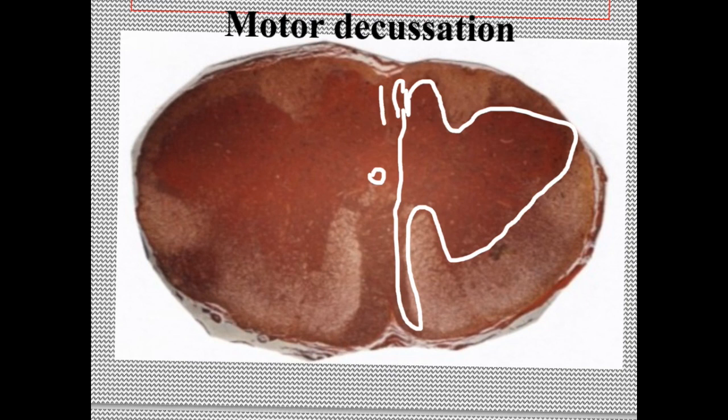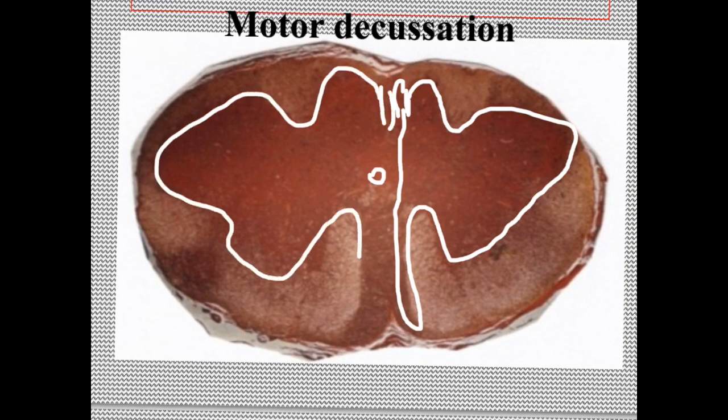And the beak of the other bird, and the head and the wings, and his limbs. So if you have the picture of a butterfly or two birds, this is the motor decussation. Don't forget that the bird moves, so it is a motor decussation.